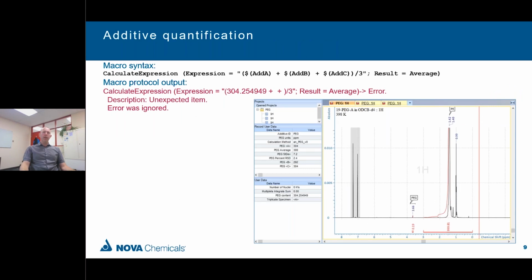While they're not impurities per se, all commercial plastics contain additives to enhance their properties. Some examples of these would be antioxidants or UV stabilizers or processing aids, where they're often present at ppm levels. Many of them are regulated by organizations like the FDA when they're used in food contact applications, so it's important that we're able to measure their content in the material.